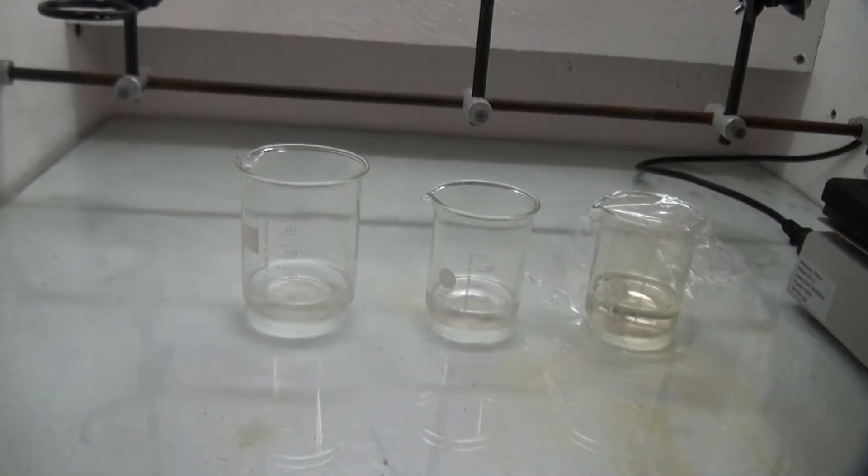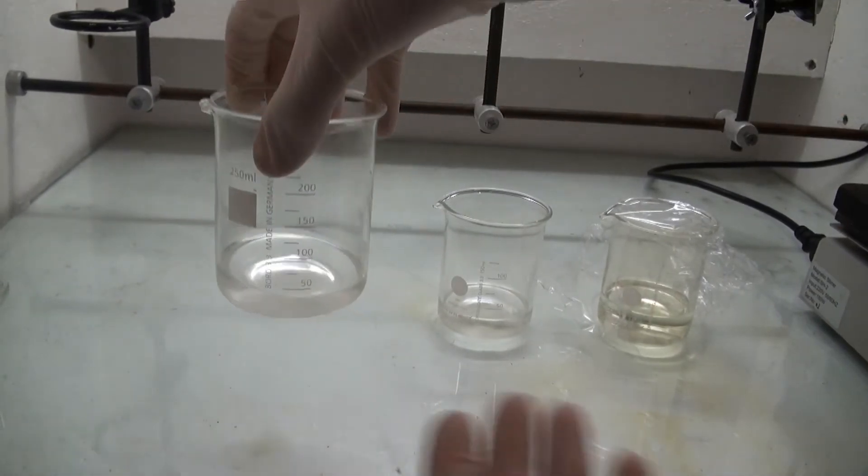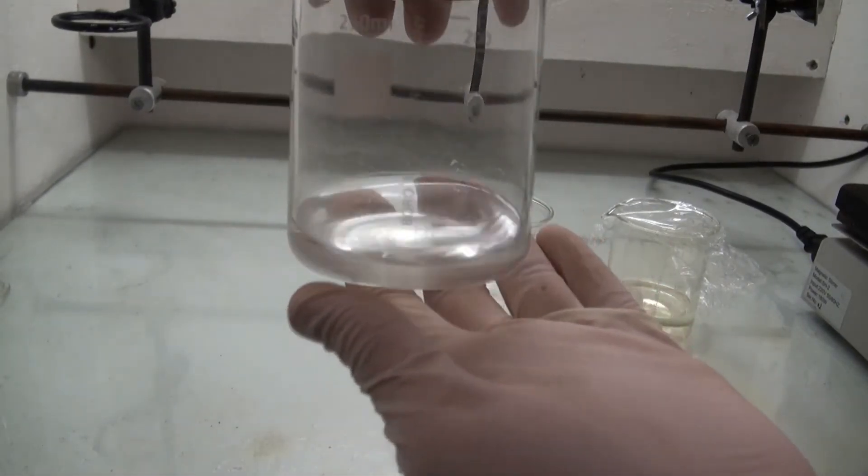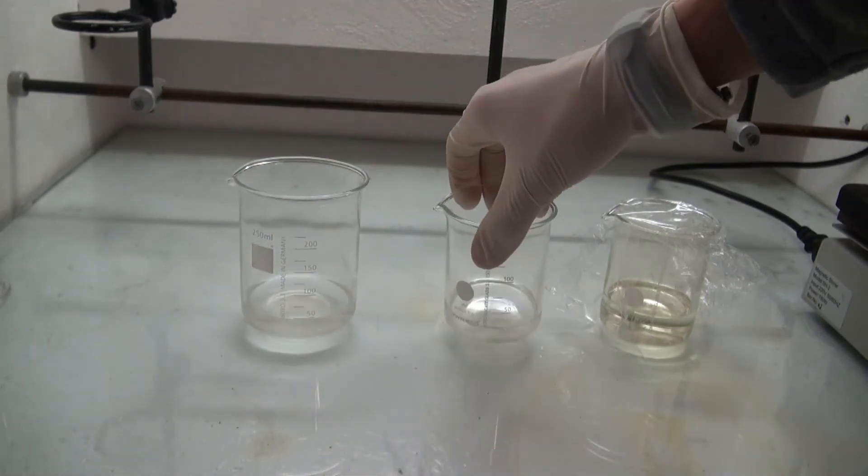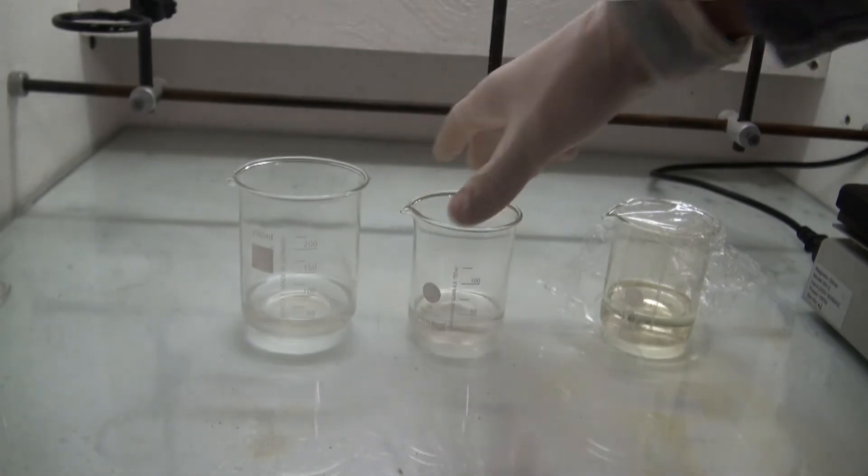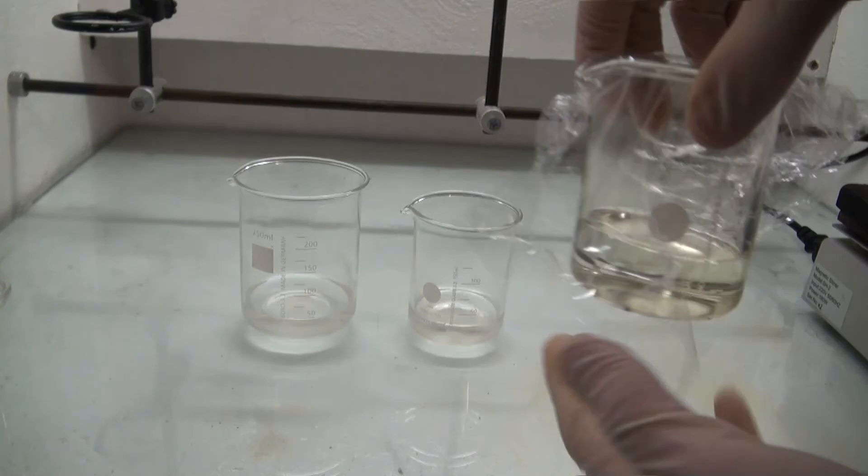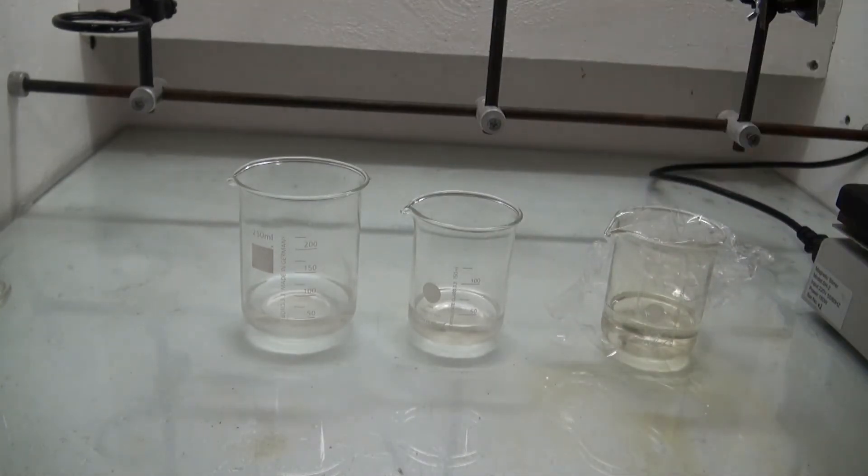Now here are the three fractions. The left one is the water fraction that came over from 98 to 104C. The middle one is the fraction between 104 and 120C, and the right one is the azeotropic fraction that came over after the temperature reached 120C.